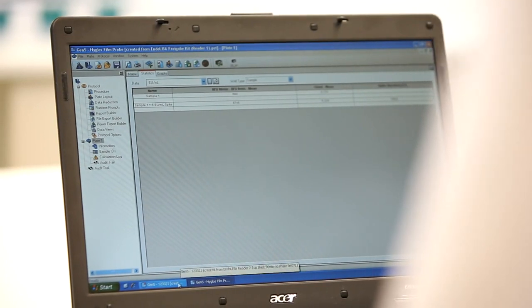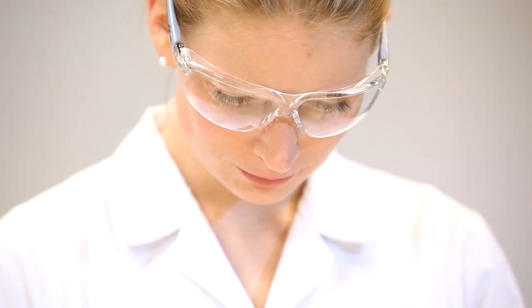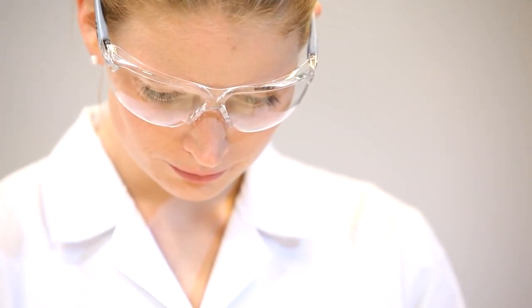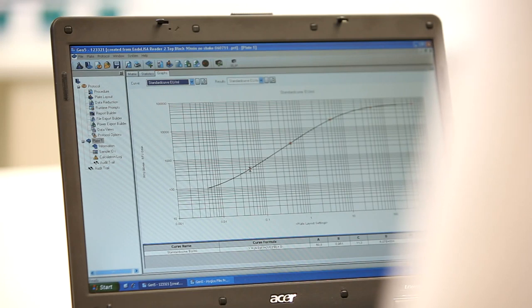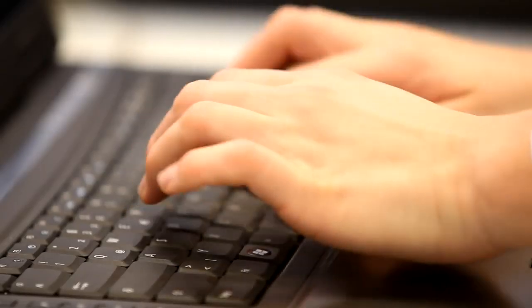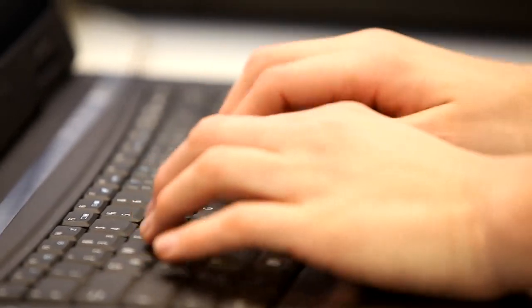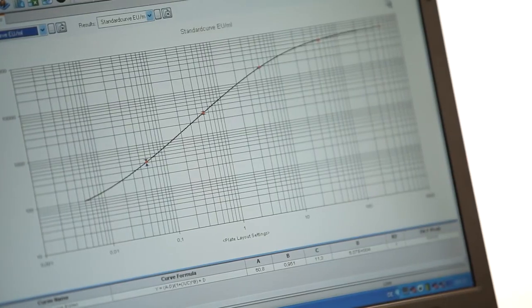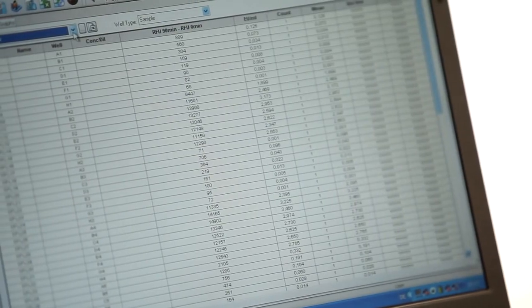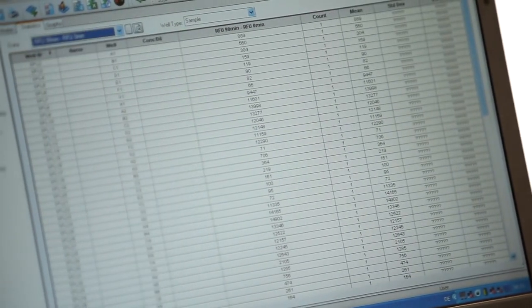Subtract the time point zero values from the end point values. Using calculation software such as Gen5, the endotoxin concentration is determined by standard curve analysis. A four-parameter logistic function is recommended for modeling the Endolysa standard curve. Alternatively, a linear model can be used. Finally, the endotoxin concentrations in EU per milliliter are obtained, ready for interpretation and reporting.